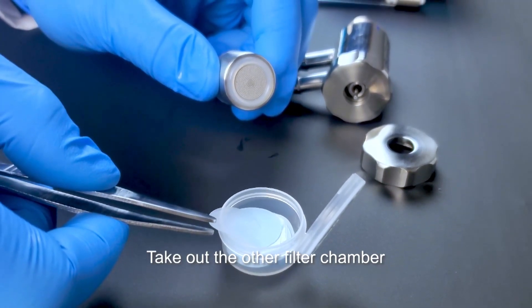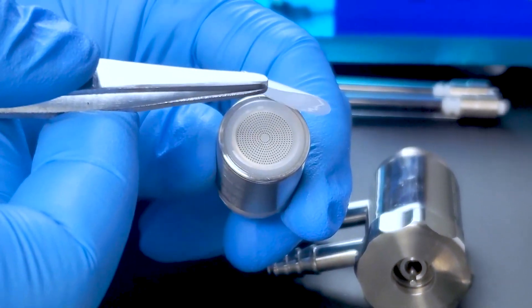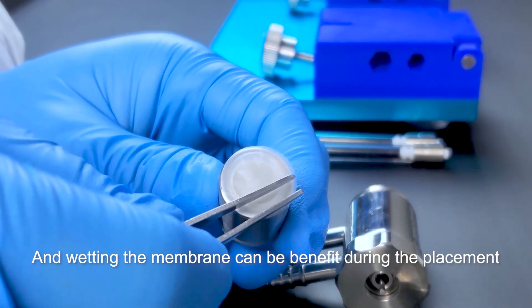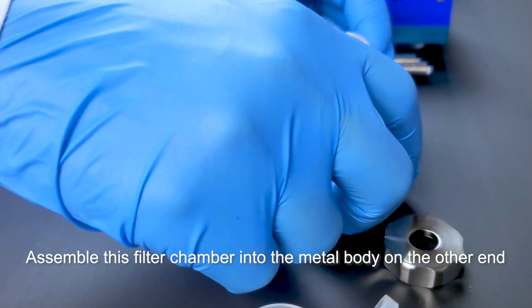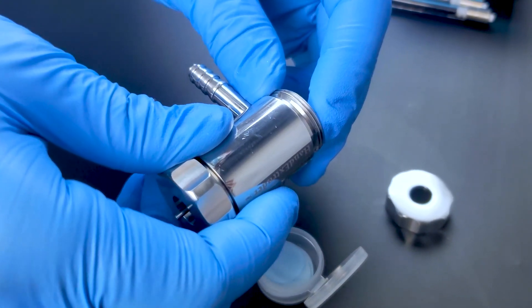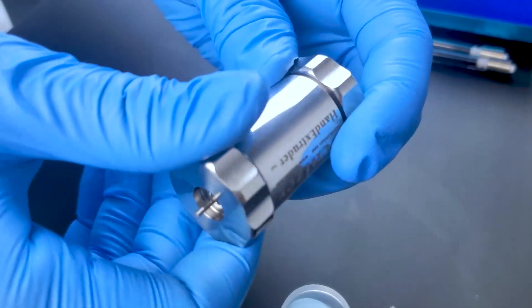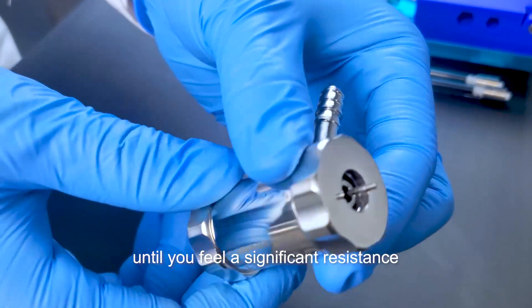Take out the other filter chamber. Use the tweezers to take a piece of track etched membrane and place it on the top of the filter chamber. The membrane should be flat with no wrinkles or bubbles, and wetting the membrane can be a benefit during the placement. Assemble this filter chamber into the metal body on the other end, screw the cap, and take care not to move the membrane. Tighten the screw cap by hand to avoid leakage until you feel a significant resistance.